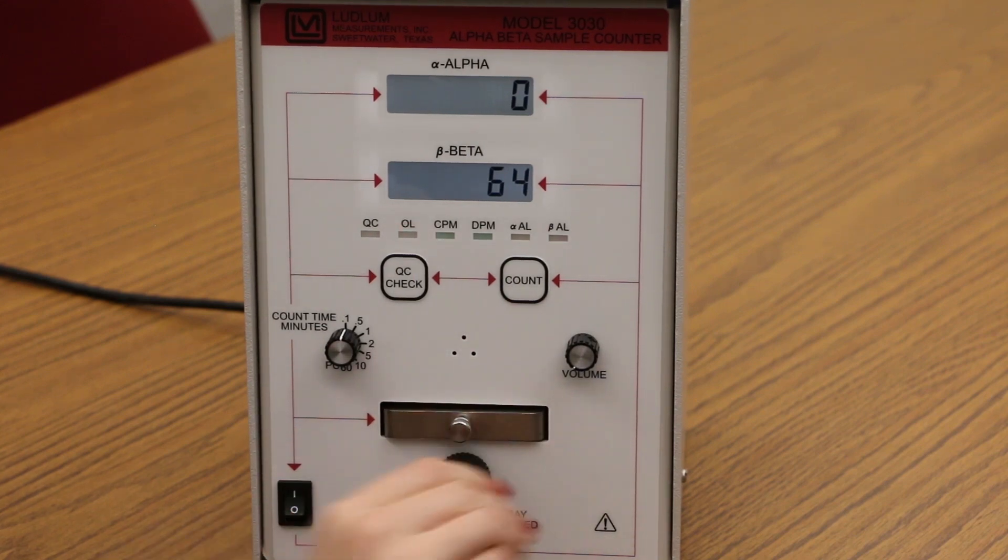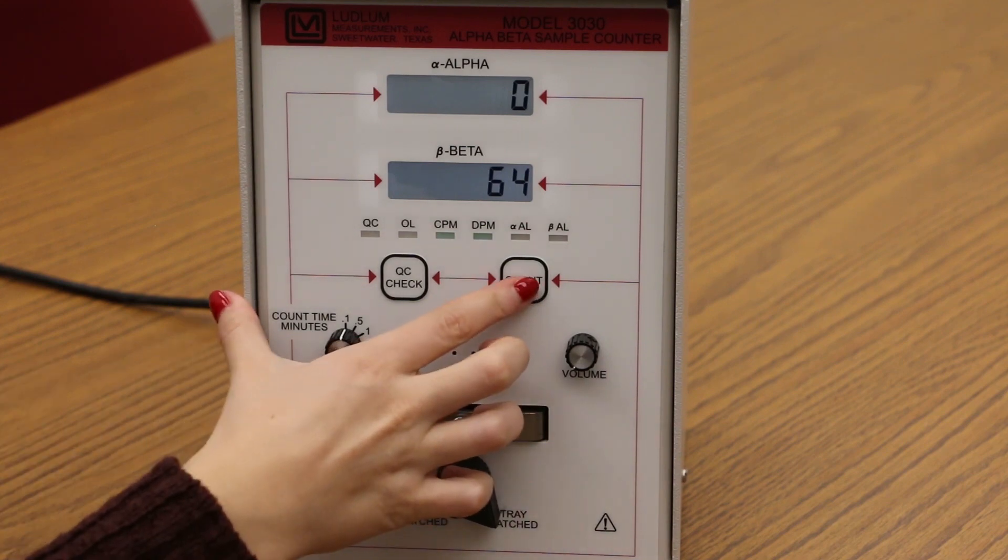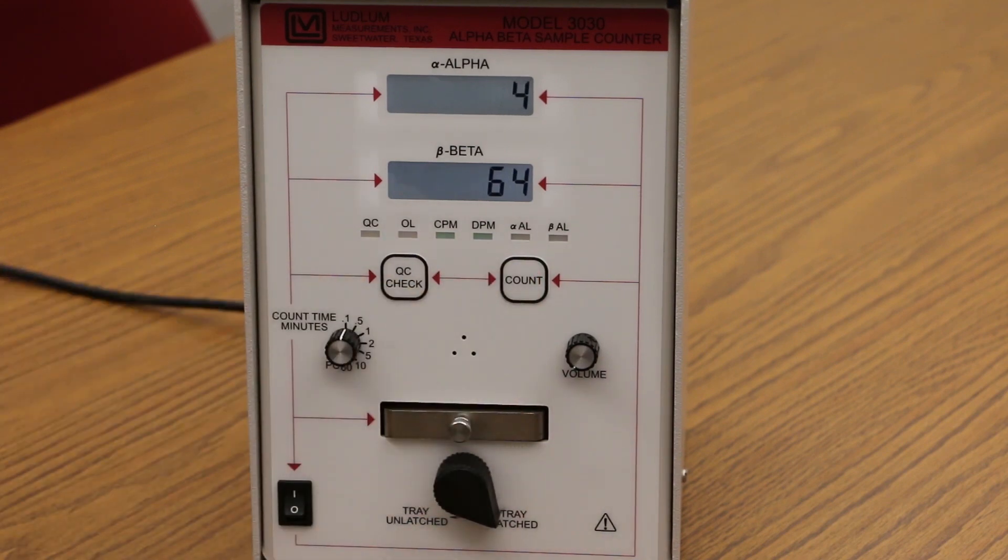Close the tray. Turn the tray knob to the latched position. Press the count button and the instrument will begin a count.